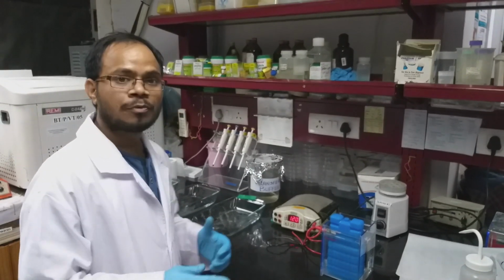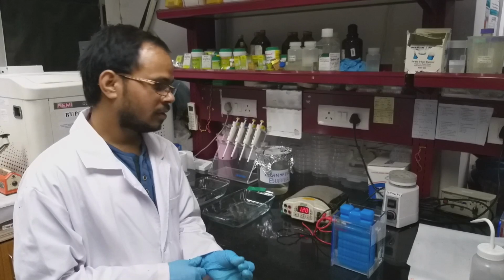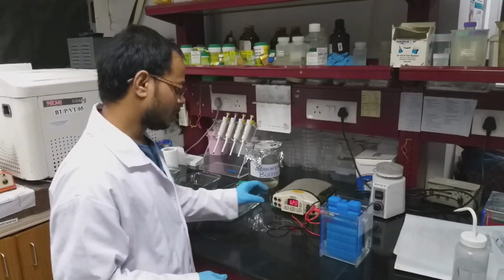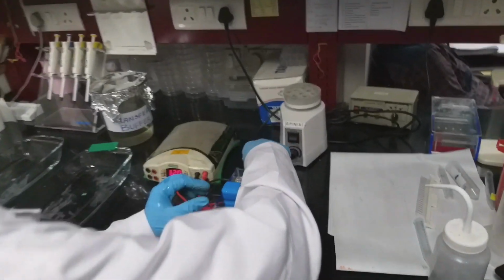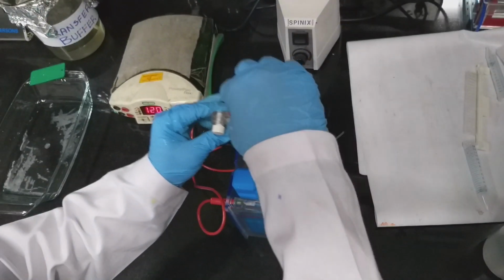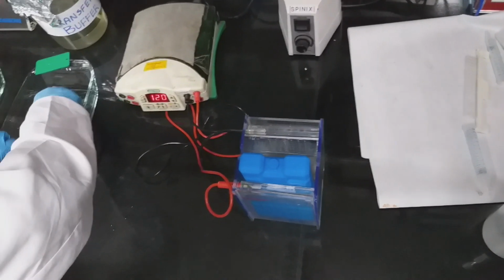After 2 hours, we have to remove the blot and incubate with the blocking buffer. So I am going to stop here. Remove the cassette, keep it in a tray.